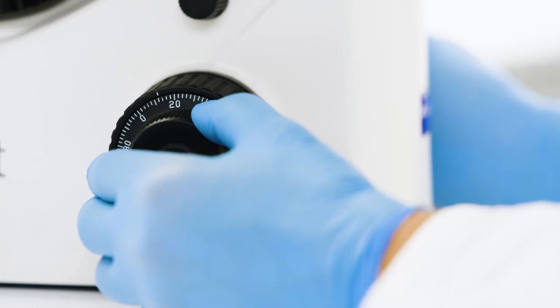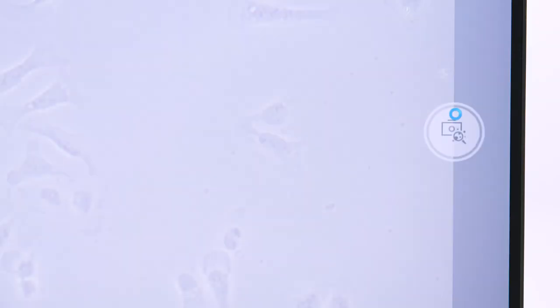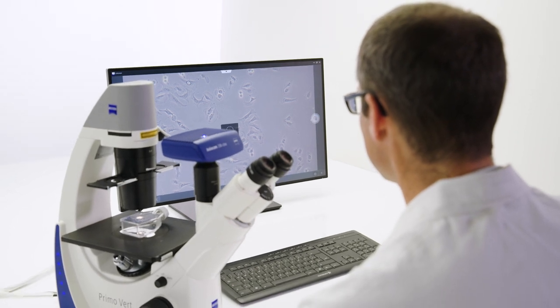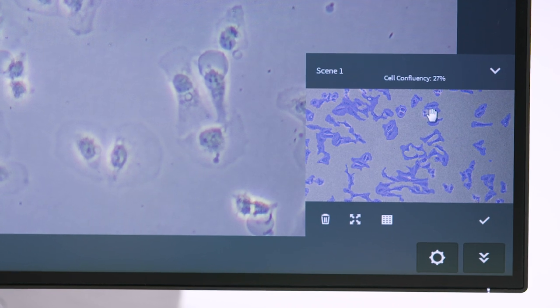Now you're ready to focus your sample. Snap an image. Using artificial intelligence, the percentage of cell coverage in your cell dish is automatically and instantly measured and displayed.